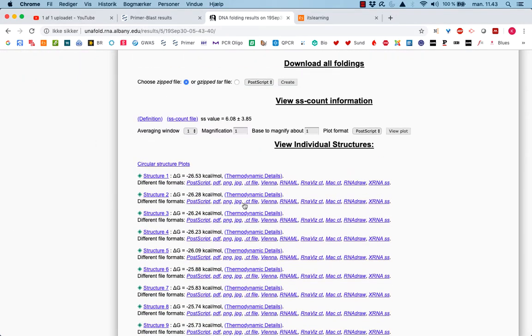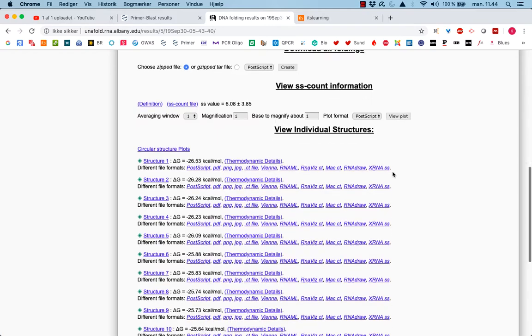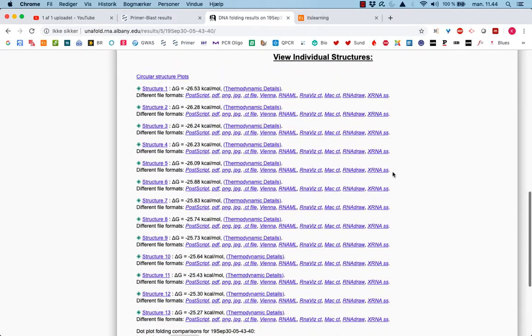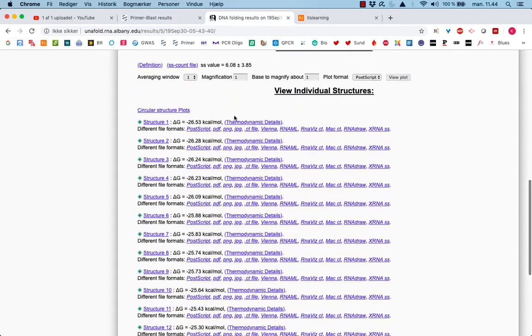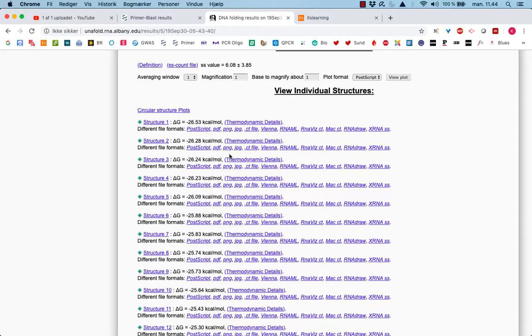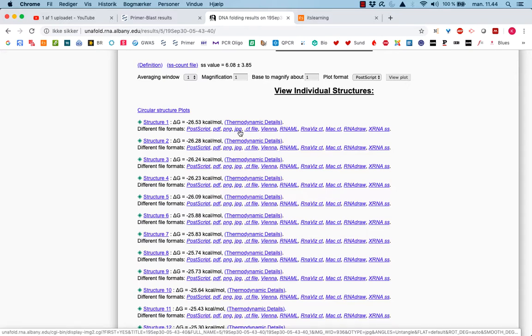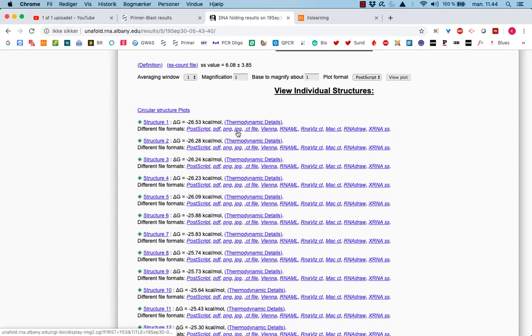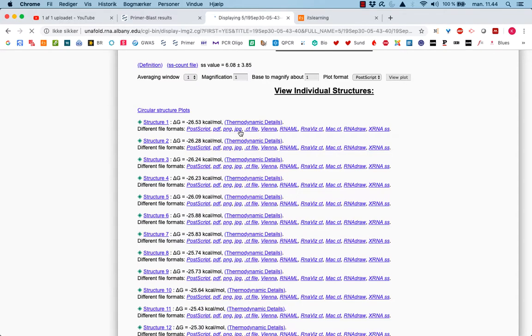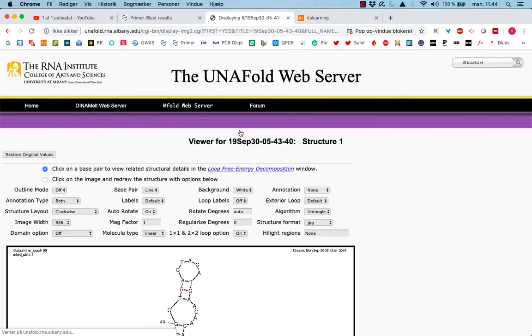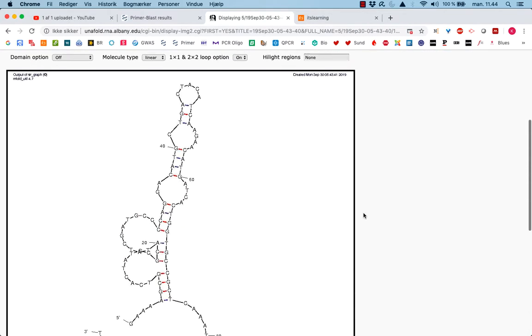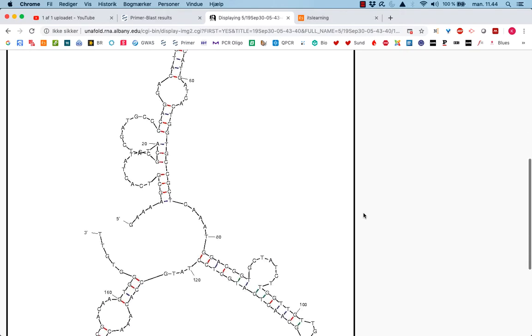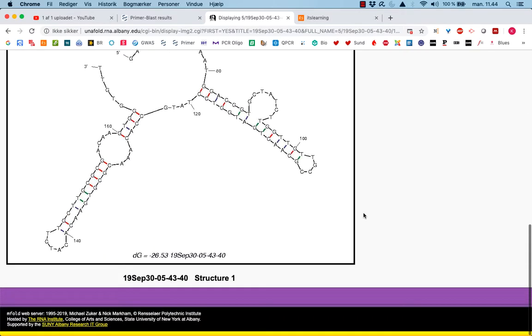And here we have individual structures with fairly low delta Gs. So that means there might be a chance, risk we should say, that we will see some secondary structures. I just take a look at one of them. Go for the JPEG. You can see there's a number of different formats. Usually, I use the JPEG because it gives you the best view of what is happening.